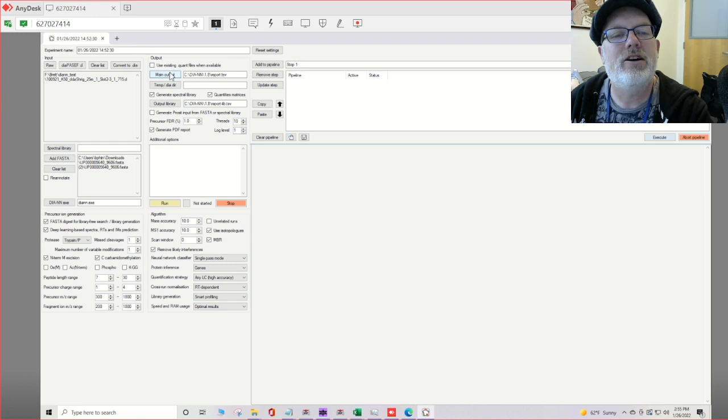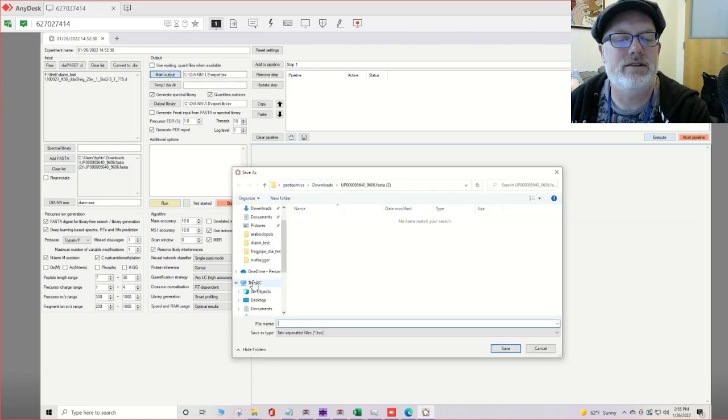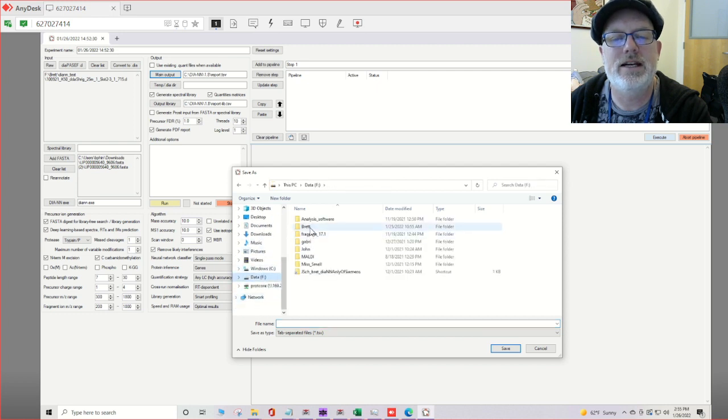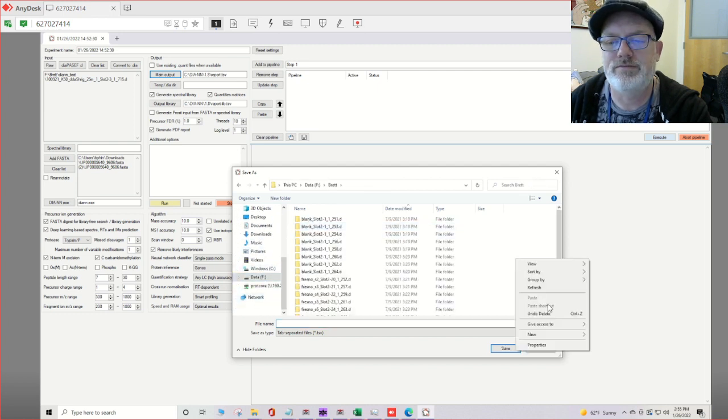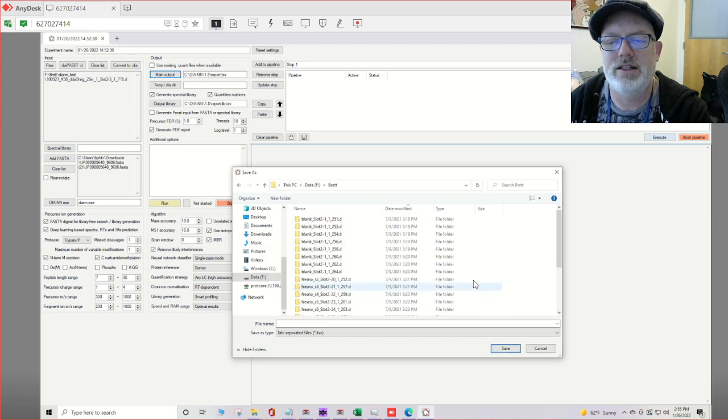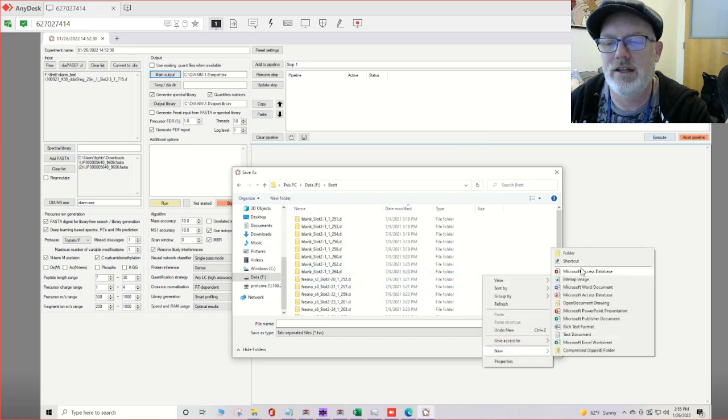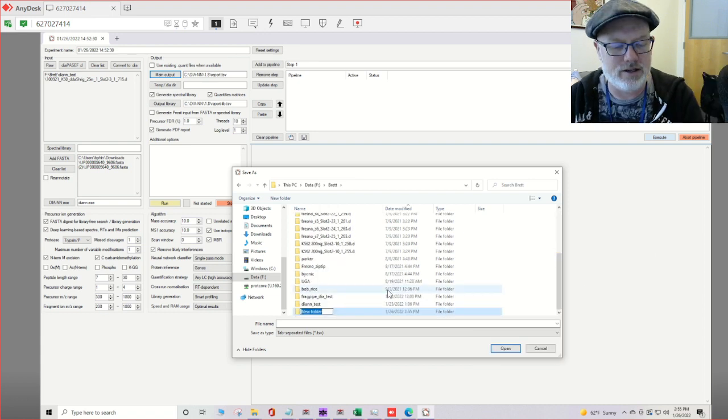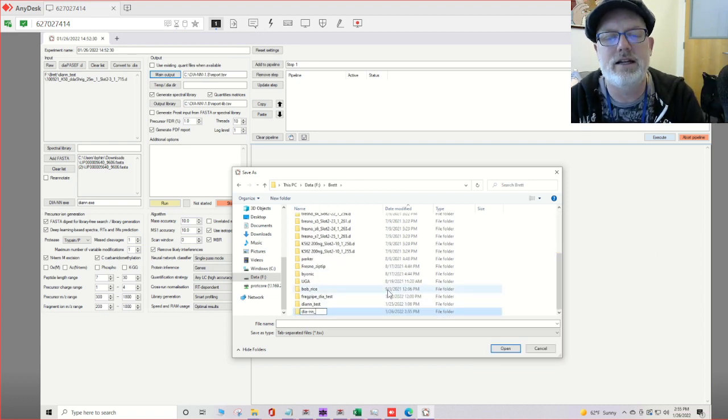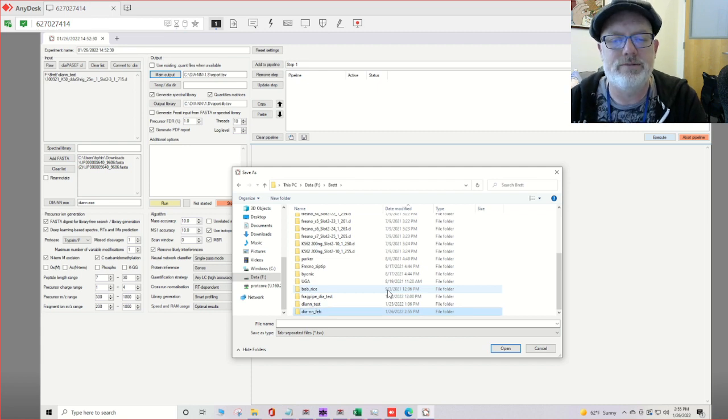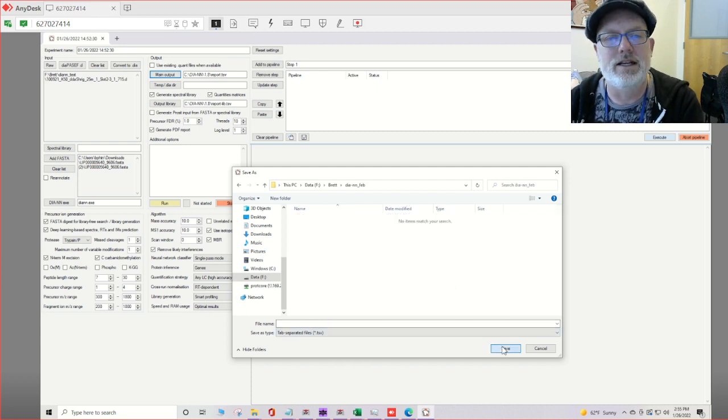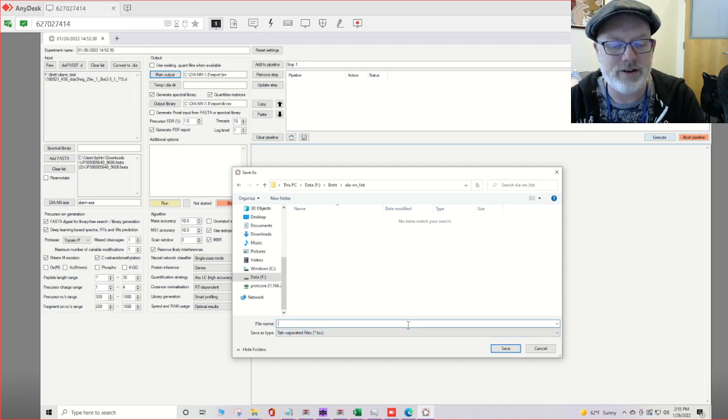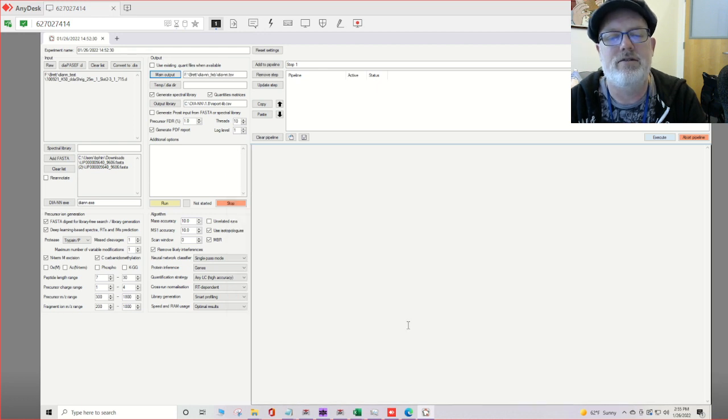The main output we're going to want to change to a directory anywhere on your drive. I'm going to put that in fbret. I'm going to make a new folder and call it DIA-NN February or something. Select that and just give it an output like whatever output your file is going to be. So DIA-NN whatever.